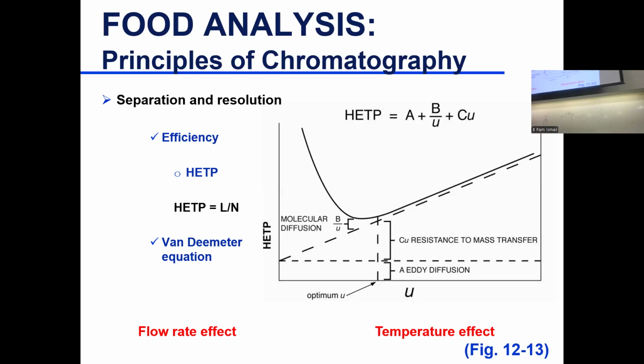Then when your flow rate is higher, you can reach equilibrium faster. However, too high of a flow rate, you will not have good resolution. Your peaks will come too close to each other, at the very beginning, early, 0 to 10 minutes, and then they might all show up as one peak. If the flow rate is so high, you won't be able to control the separation because everybody's starting to move too fast and not enough to reach equilibrium.